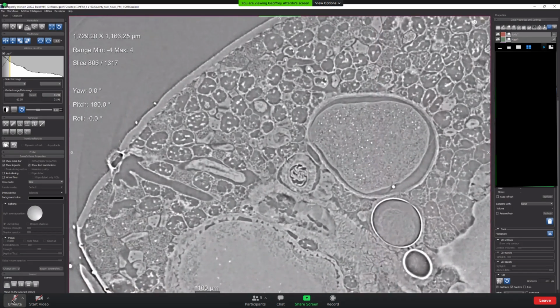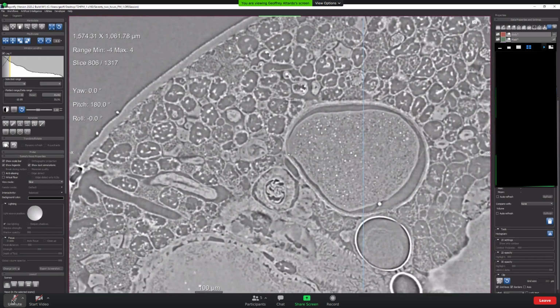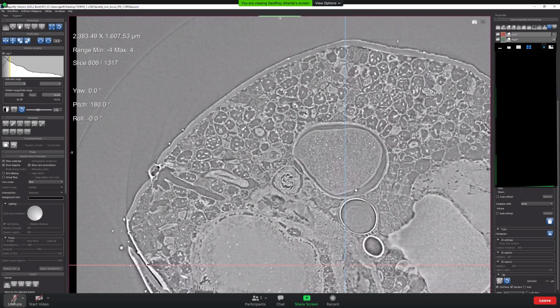But the issue that we have is that it's all soft tissue, so a lot of the gray values are kind of similar to each other. Right. Can you show us what you did before, like manually? Sure. Yep. Let me load that session up.